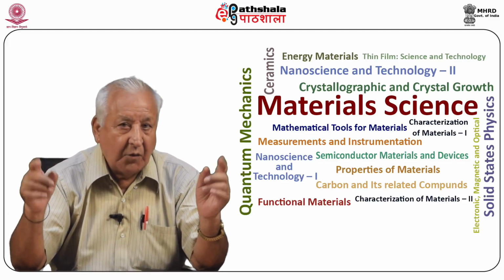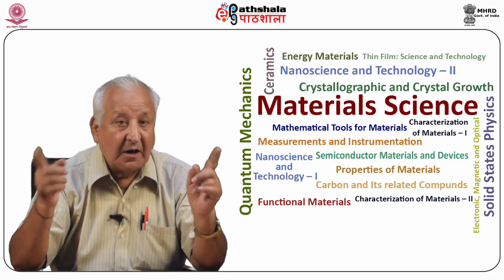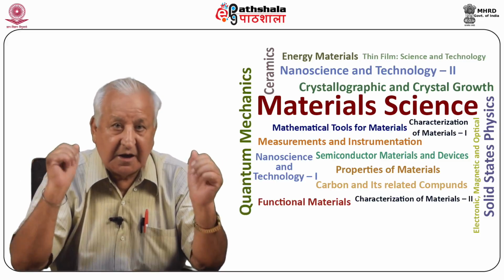The experimental setup for the rotating crystal method and the modified rotating crystal method are illustrated and described. Production of layer lines in rotation photographs is discussed.